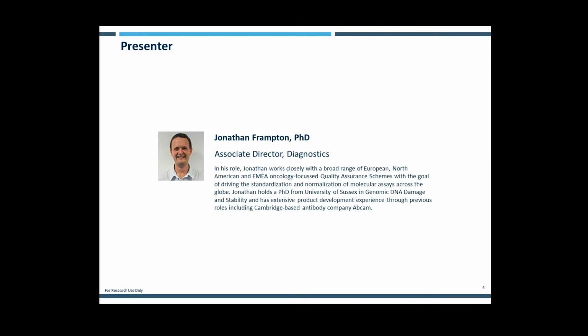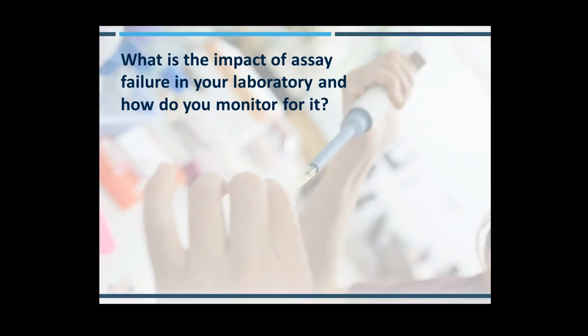So what I want to talk to you guys today, and Natalie will be the co-presenter, will be getting to the nitty-gritty details and the really exciting data to discuss. Is NGS and applying NGS and certain pitfalls you may be facing.